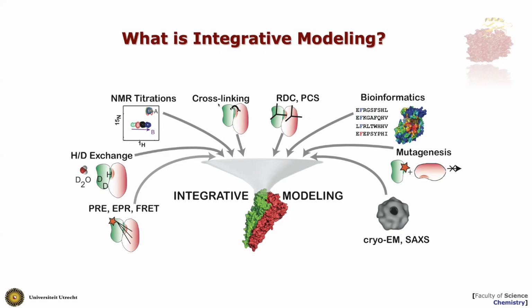Classical example, cross-linking detected by mass spectrometry will provide you some distances between two amino acids, and the distance will depend on the chemistry which is used in the linker. But think of FRET experiments, DEER experiments, so any type of experimental data that can be translated into a distance in principle can be used in HADDOCK. You might have orientational information. This is data coming from NMR. And you might have also shape type information.